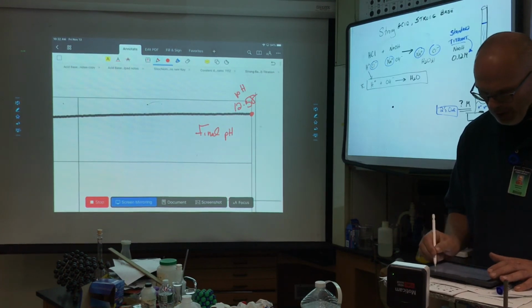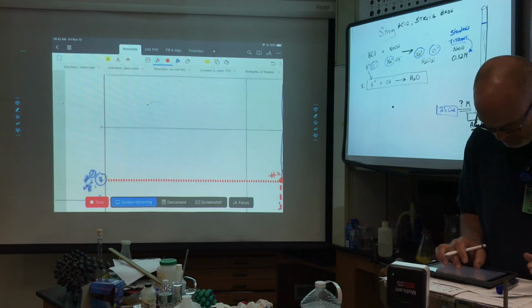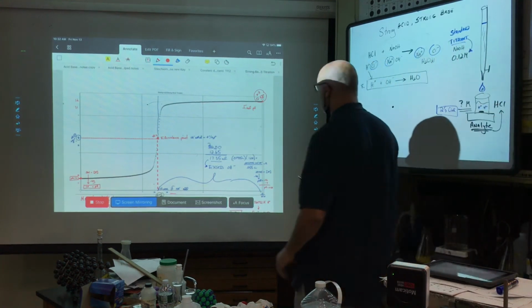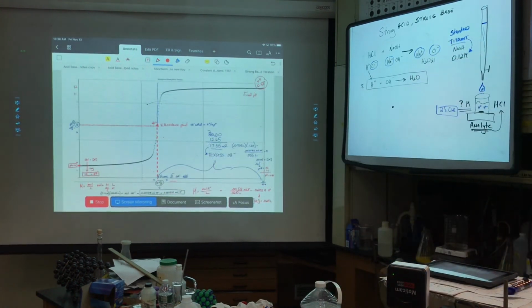Now whether our probe shows us that. If I was to look on this, what do I got here? 10, 11, 12, where's that line? Yeah, that's pretty reflective. I think that's definitely very reasonable, 12.58. Okay, we have one little piece left in this.